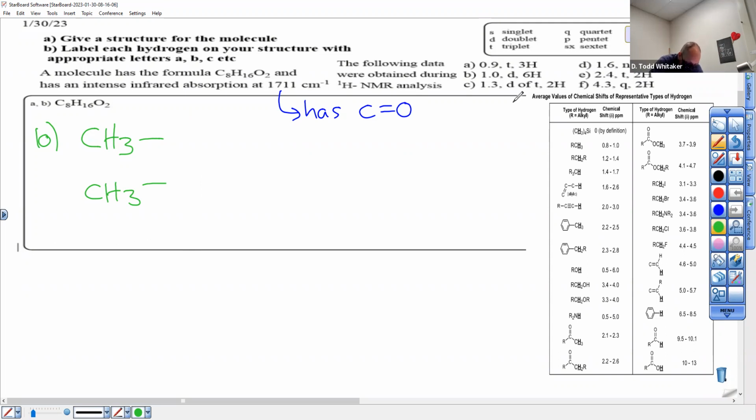What kind of pattern are we talking about? A doublet. Oh, this is your traditional isopropyl. You'll see the pattern with 6 H's all the same, and they're a doublet. That means they're connected to a carbon with how many H's? 1 H. And this is kind of the scenario I was just talking about. I'm just going to make it look better. Here's the carbon with the 1 H. And that's, if you look at it, that's an isopropyl group, isn't it? Yeah.